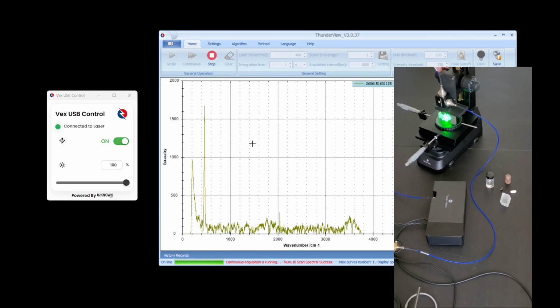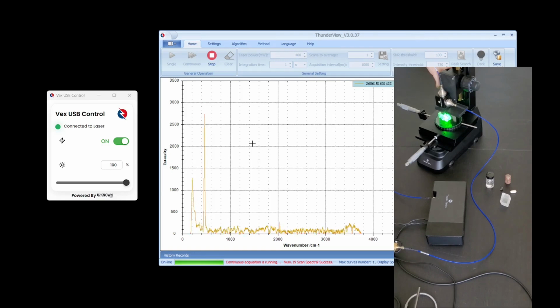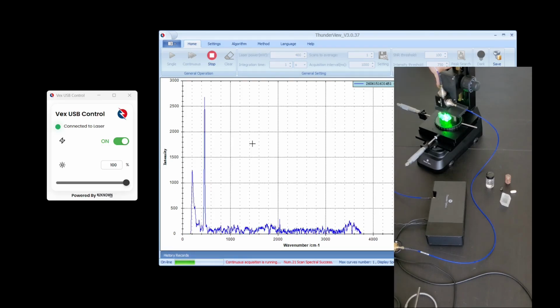So here we can see the apparition of the quartz peak. In order to optimize, I will go slightly lower. Here we can see that we decreased the peak, so I have to go slightly above. Move up. Well, this should suffice. So here, this is the preliminary settings. This is not the final measurement. So we have to stop signal. Now that we are pretty well placed, we can still optimize it.